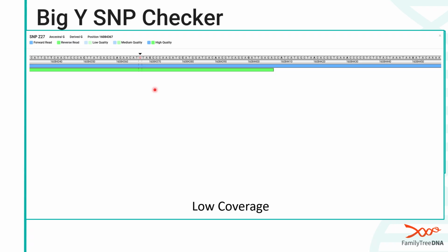Now, with these tests, you're looking at a large area, and they're really great at being able to pick up new mutations, because they're not targeting just a specific location. They're targeting that whole area, and they're reading everything that they can in every single read. But the thing is that depending on your research purposes, you may not actually need every single read in every single area.